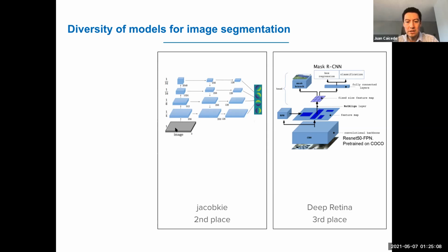Basically, in this case, we take the image as an input, and then we compute multiple feature maps that are used to generate several intermediate outputs. So you get feedback on all of the scales of the image, in order to improve the features at different resolutions. At the final layer, you are aggregating information from all those resolutions in order to generate the specific output.